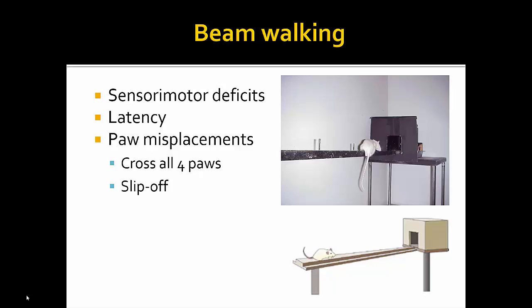Yes, so behavior takes a lot of patience and energy and time. They're very simple tests in theory, and then once you get in there, that was the caveat. What depends in your lab, what works, and does it work with your particular assay? Could it be that your disorder is too much for this particular assay? Could there be another one that you could do?